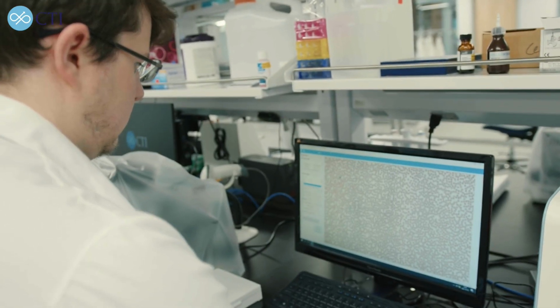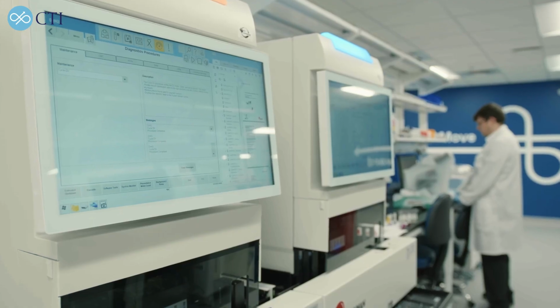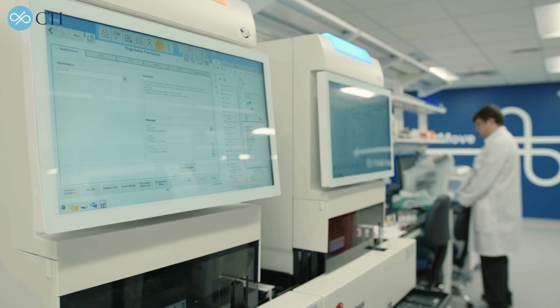Similarly, any samples that will be put into storage, if we subsequently find out from the investigator sites that data associated with those samples needs to be updated or changed, we go into our database and update it and change it, so that if we send those samples on to another lab for testing or somewhere for long-term storage or we hold them, we want the data to be current and consistent and aligned with the clinical study database.